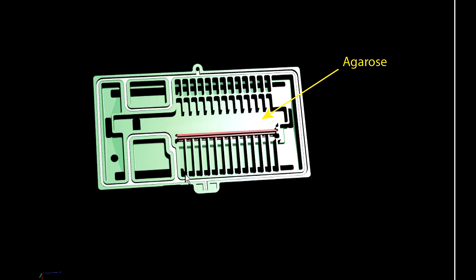There are key areas of the gel where the current flows beneath the agarose, and it is important to keep these clear of bubbles, which may impede electrophoresis. The area behind the elution wells must also be cleared of bubbles.